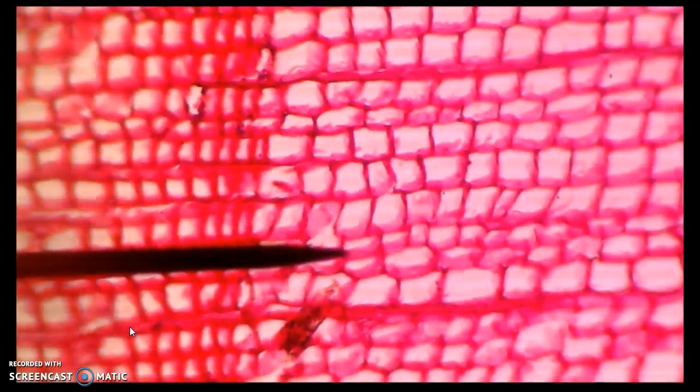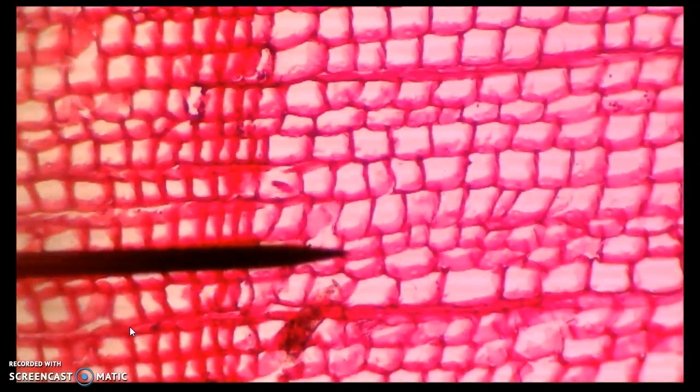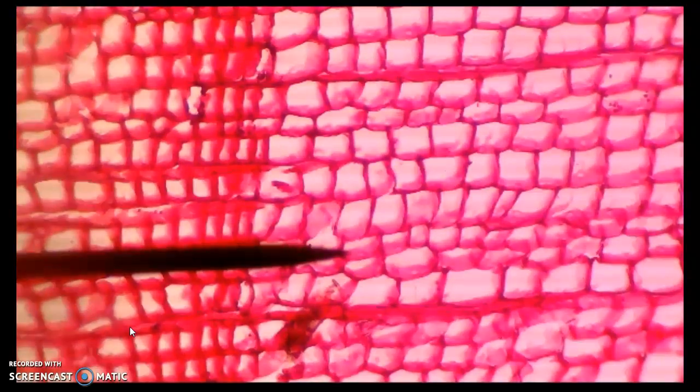Okay, now we're going to switch over to the 100 power lens. Okay, it's zoomed in quite a bit more. I'm going to use that fine adjustment knob to get a little bit more into focus for you. Okay, now you're going to sketch in the middle circle what you see on the lens.